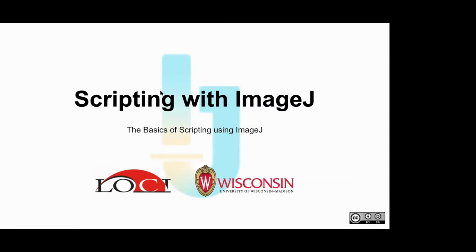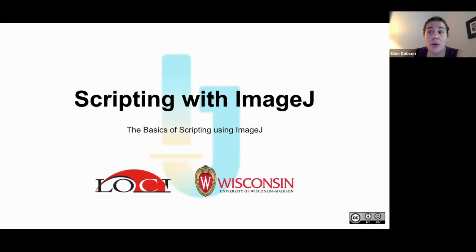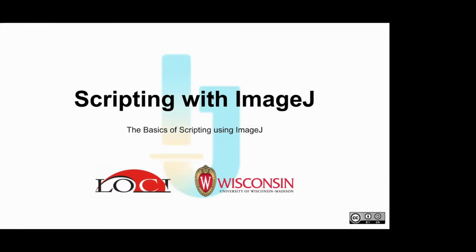Nothing in the chat. Does anyone have any questions that they would like to unmute and ask? Okay, we have one in the chat. How would you apply this segmentation to a stack? Oh, that's a good question. So yeah, you can do it per slice.